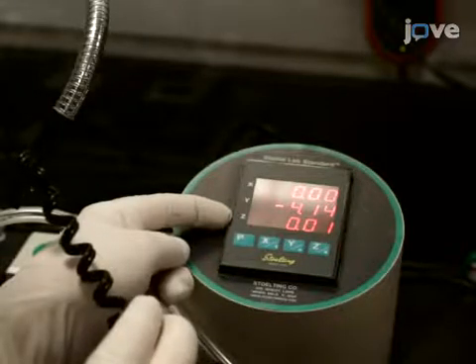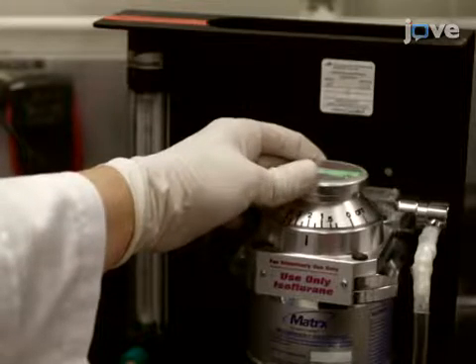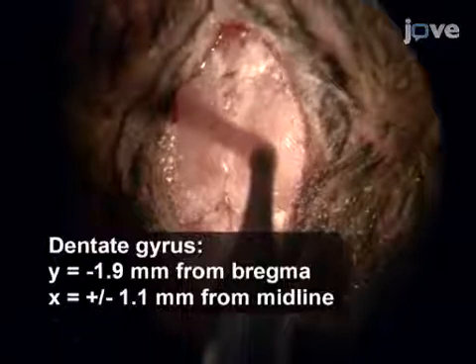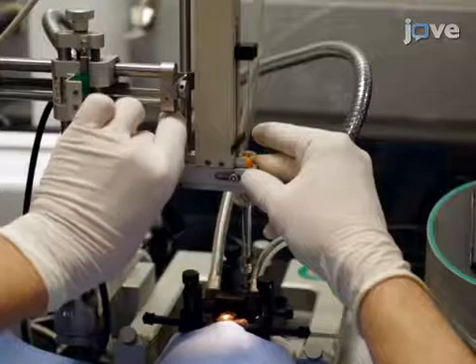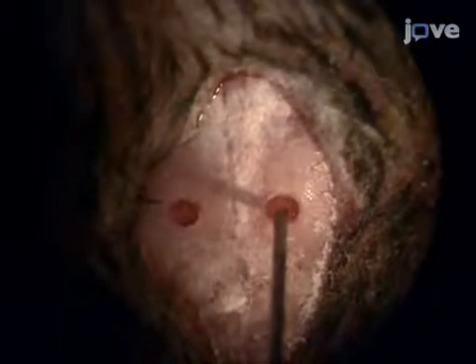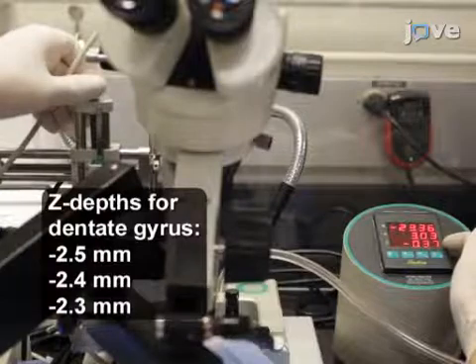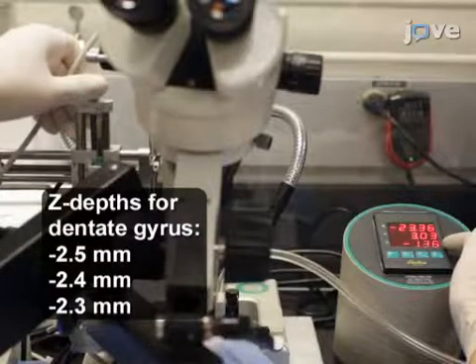In order to ensure that the head is leveled on the rostral-caudal y-axis, place the drill bit on lambda and level the head so that the z coordinate is roughly equal to zero at both bregma and lambda. To ensure that the head is leveled along the x-axis, place the drill bit on the midpoint between bregma and lambda and measure the z coordinates at one millimeter from the midpoint on both sides to ensure that they are equal. Next, lower the isoflurane to 2% before placing the drill over the desired coordinates and drill through the skull carefully. After drilling all the holes, affix the virus-filled syringe onto the stereotactic instrument. Center the syringe over the hole and set the z coordinate at the skull to zero.